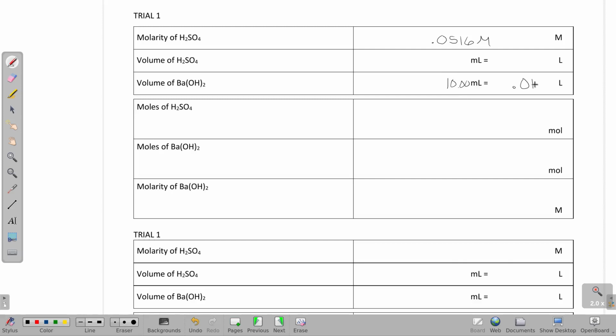So 0.01000, we're actually that good of a number using those volumetric pipettes. But the H2SO4, because I used this higher concentration, this didn't get much above 3 milliliters. So it's going to actually hurt our precision, because that first time I did it where I got it to dropwise, I got 3.25. It was almost perfectly between the 2 hash marks.